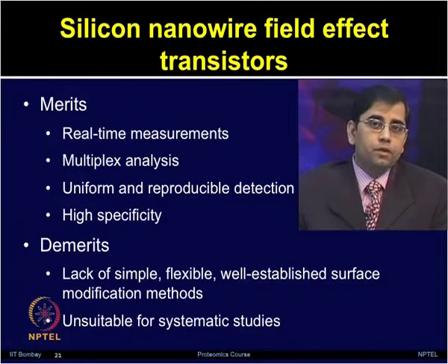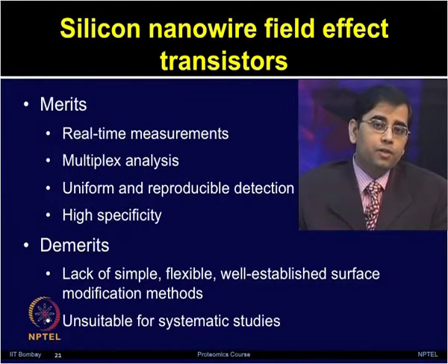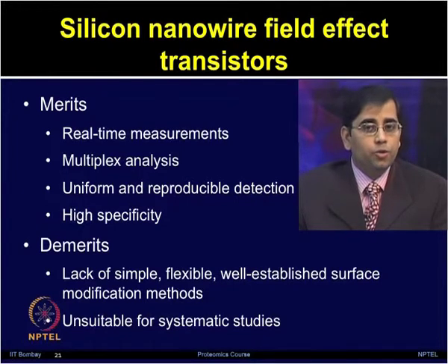Now, discussing the demerits of this platform, the lack of simple, flexible and well established surface modification protocols is one of the limitations, and it is also not very suitable for systematic studies.